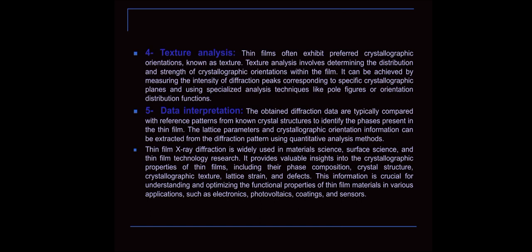Fifth one, data interpretation. The obtained diffraction data are typically compared with reference patterns from known crystal structures to identify the phases present in the thin film. The lattice parameters and crystallographic orientation information can be extracted from the diffraction pattern using quantitative analysis methods.